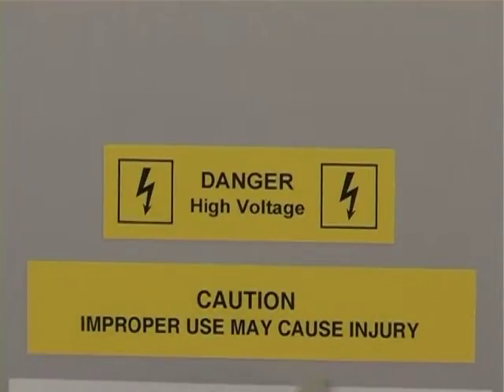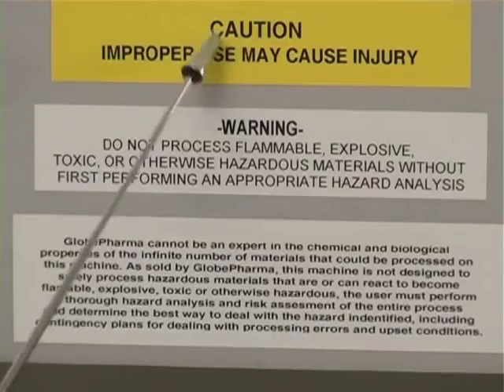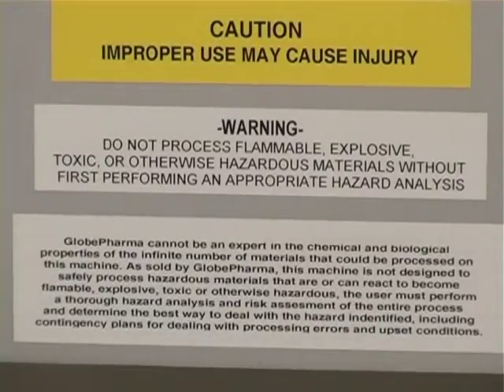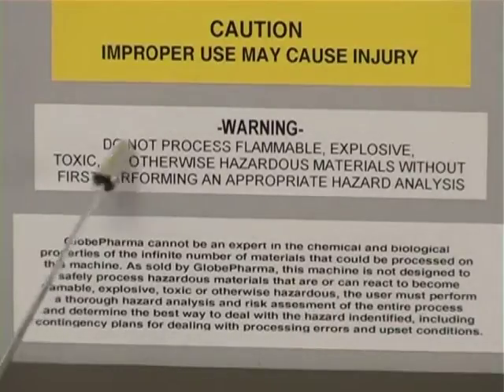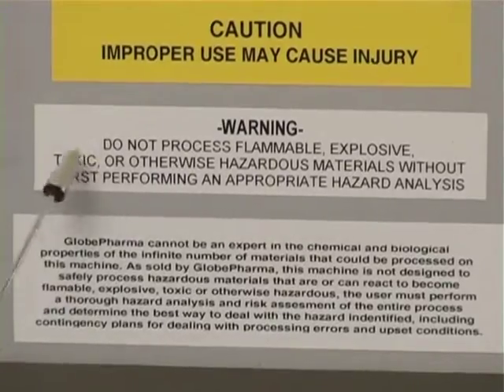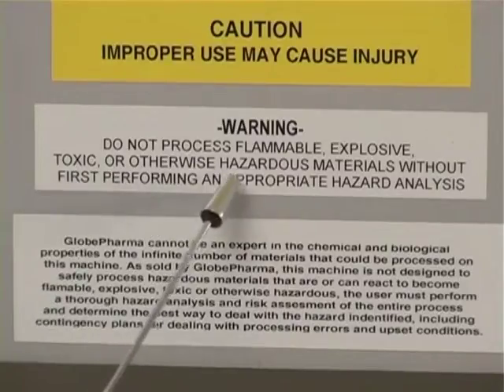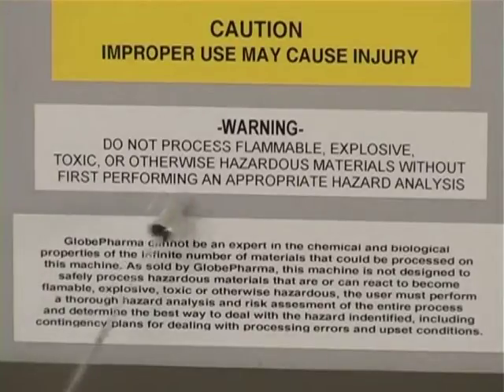Improper use may cause injury. Warning: do not process flammable, explosive, toxic, or otherwise hazardous materials without first performing an appropriate hazard analysis.